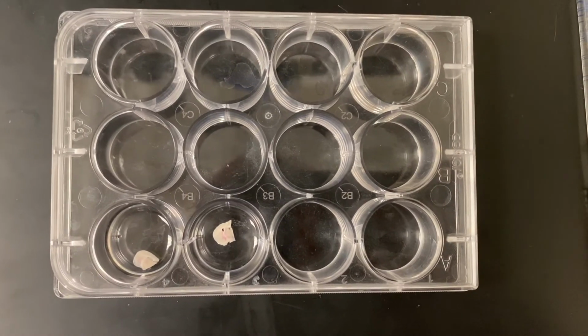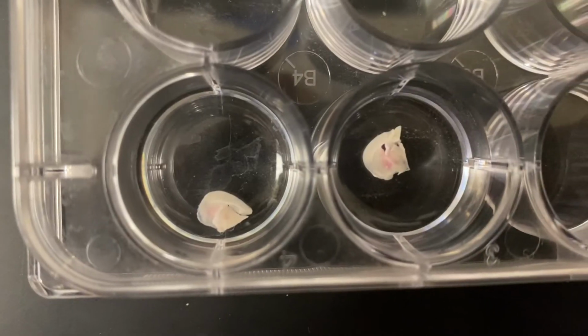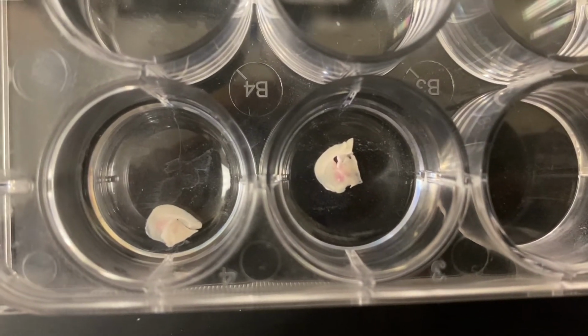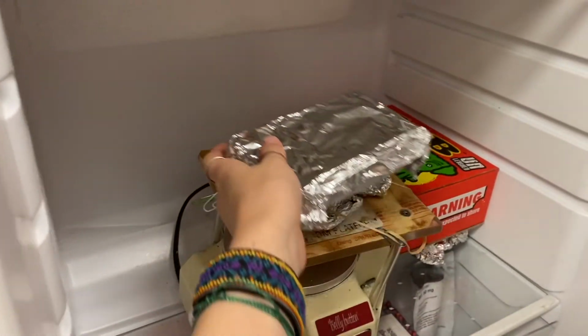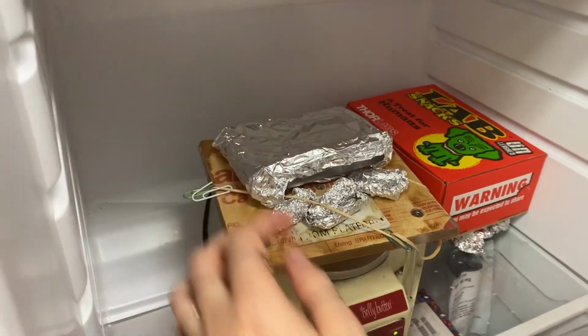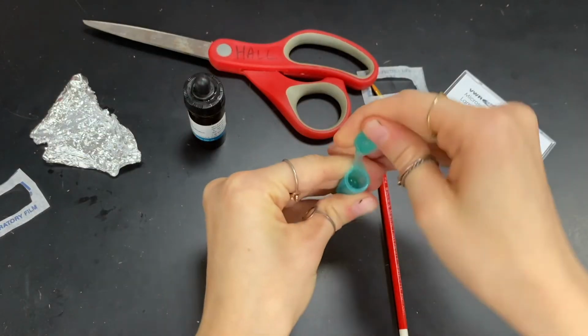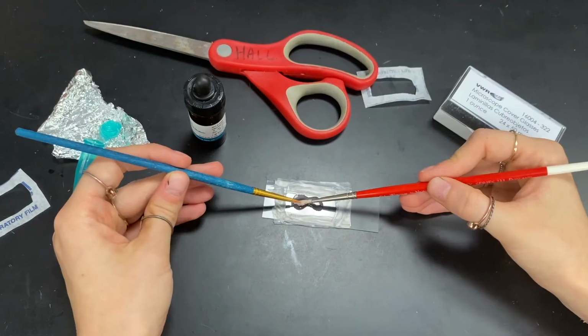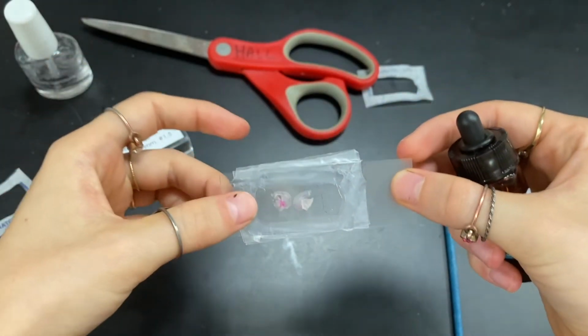However, again, I think this might have been too much. When it's easily visible to the naked eye, I tend to get a bit worried about what I'm going to see under the microscope. But I'll leave it rocking in the fridge for the night and see how this one fares in the morning. The mounting is definitely getting a lot easier with practice, or maybe it's just my lack of acrylic nails.